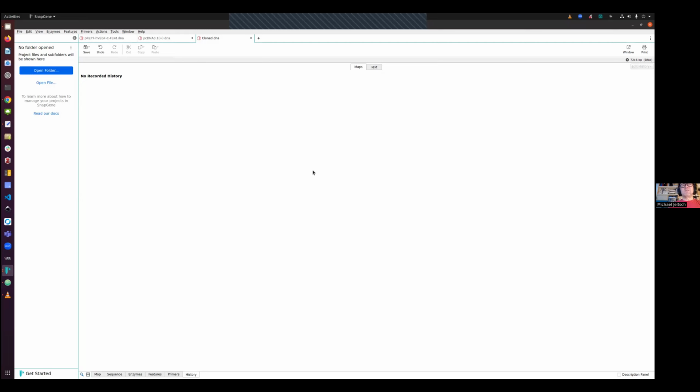It has something to do with the remote disks, whether they are mounted on your computer or not. If certain remote disks are mounted on your computer when you open the program, you won't be able to open certain files. So don't hesitate to contact me, and we can sort it out also in person.